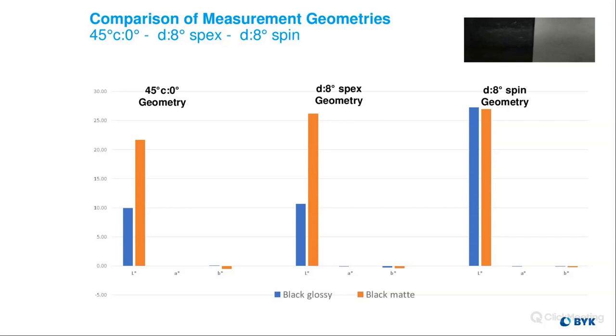Okay, another question here. Should I dim my QC room light when using the Spectra 2 guide? Does the room light interfere with results? No, the room light doesn't interfere with the results because of the way the instrument is used, it blocks out all that other light.